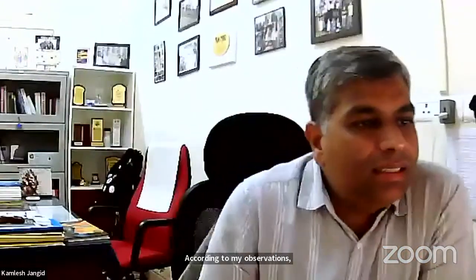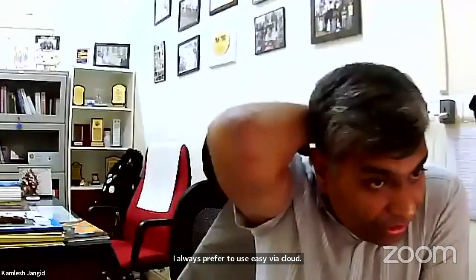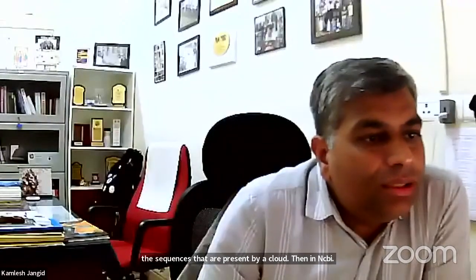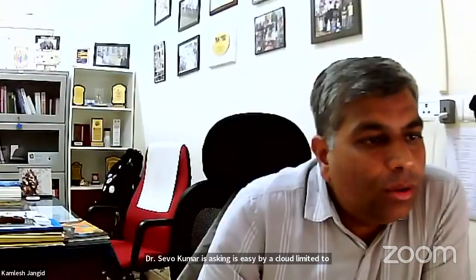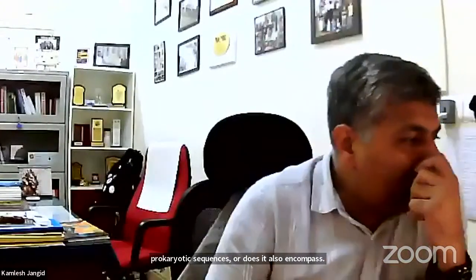The first one is, according to my observations, EzBioCloud is good for 16S sequence. Yes, it is. I always prefer to use EzBioCloud. And being a culture collection, we always rely on the sequences that are present in EzBioCloud rather than in NCBI. Dr. Sivakumar is asking, is EzBioCloud limited to prokaryotic sequences or does it also encompass eukaryotic sequences? Frankly, I'm not sure. Let us see.